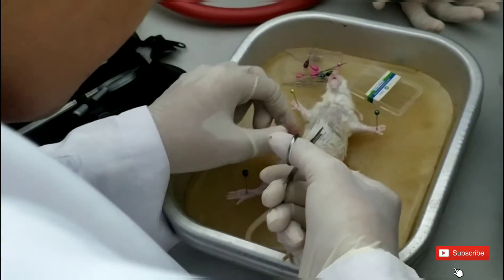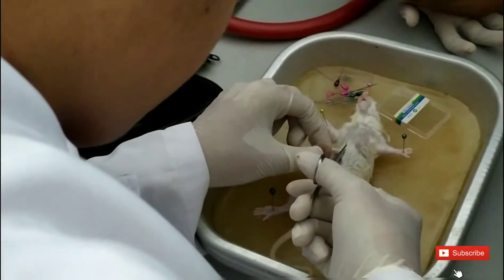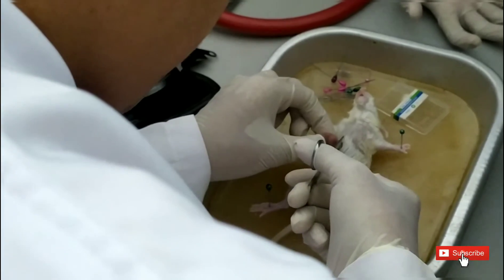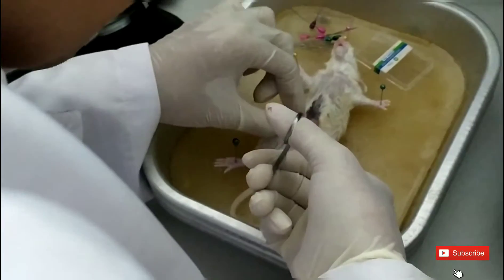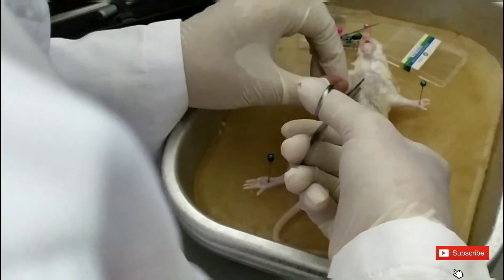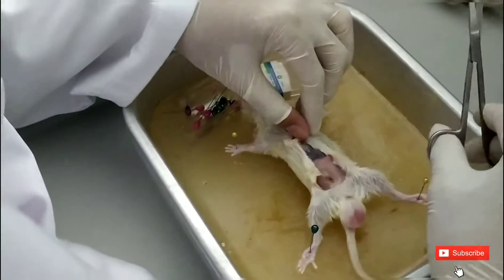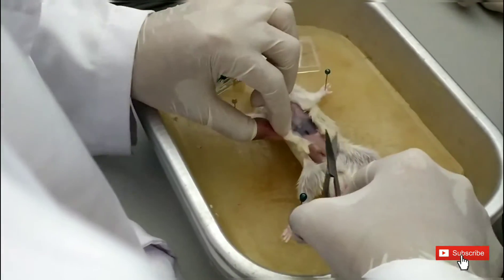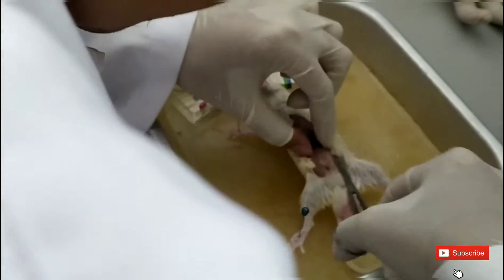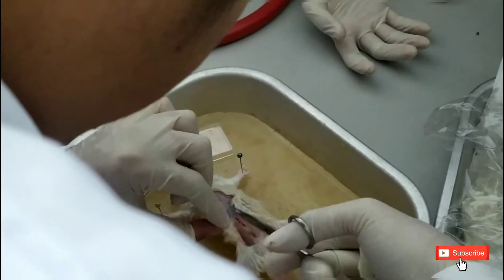We have to cut it smoothly and slowly. Okay, it's open slowly. After we cut the skin, there will be some membranes that connect the skin to the organ, so we have to also separate this membrane. These are my students, by the way — this is grade 7B.